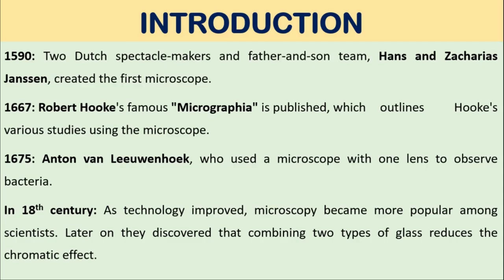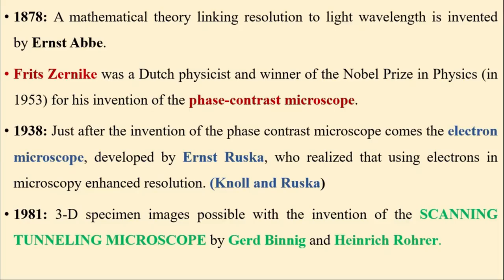In the 18th century, as technology improved, microscopy became more popular among scientists. Later on, they discovered that combining two types of glass reduces the chromatic effect and we get a clearer image. Next, in 1878, a mathematical theory linking resolution to light wavelength was invented by Ernst Abbe.